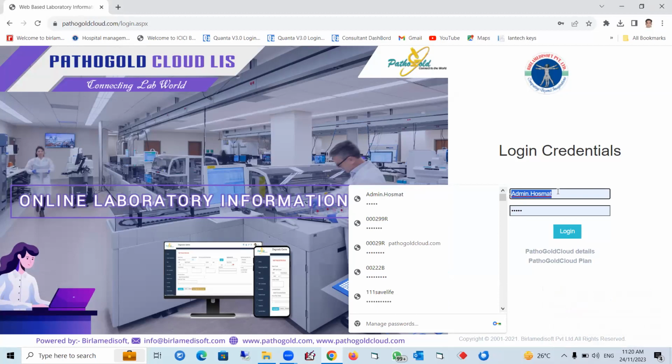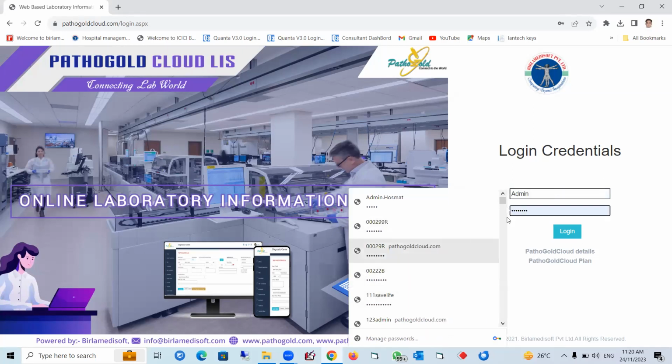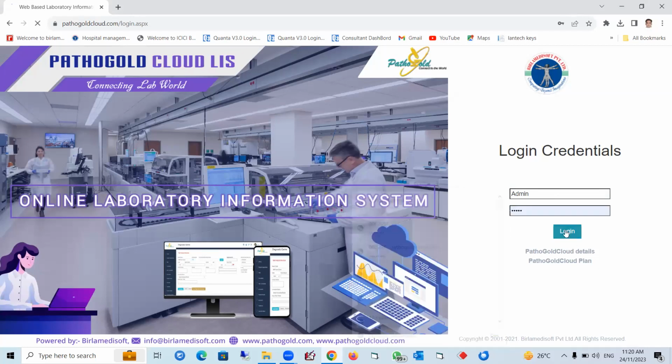And the third one will be the collection center. How to define a collection center, what is the use of a collection center, everything we are going to study in this demonstration. So let's see one by one what the benefits are and what the things are about these various aspects.